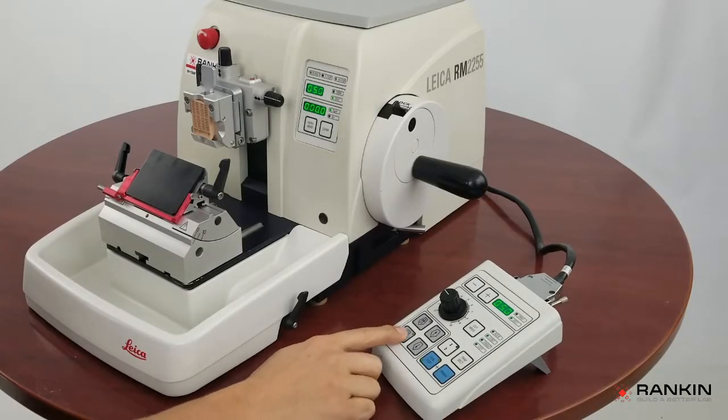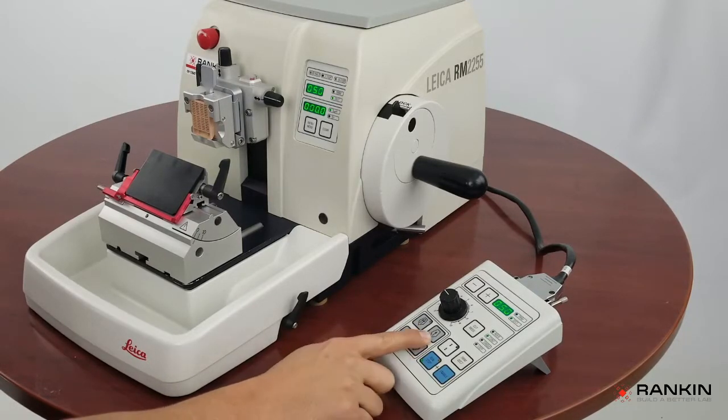Now, these are your course advance and course retract buttons. And this is your fine advance and fine retract button.